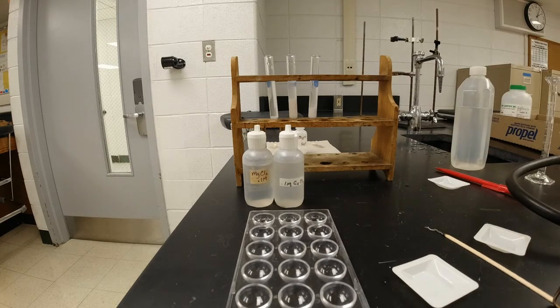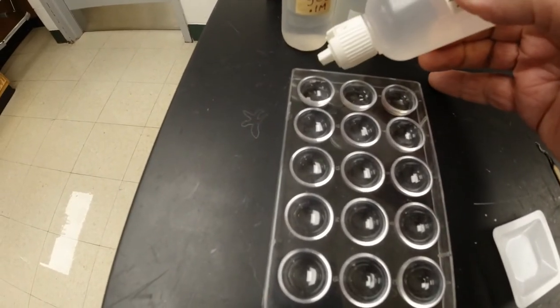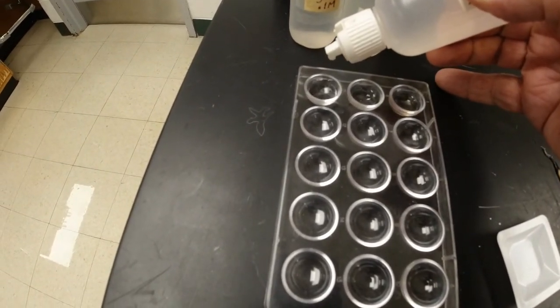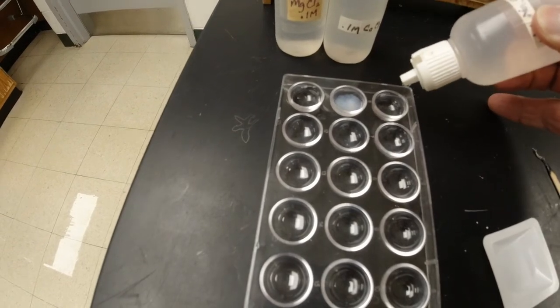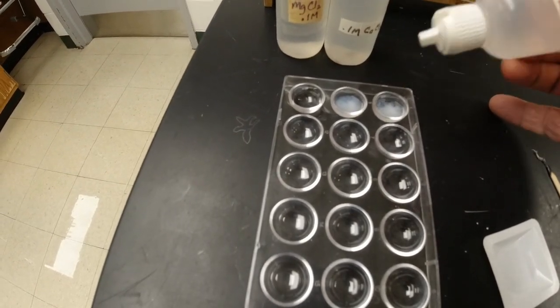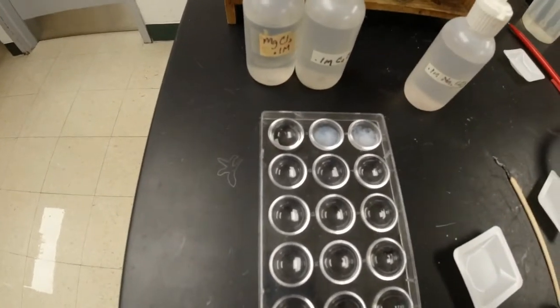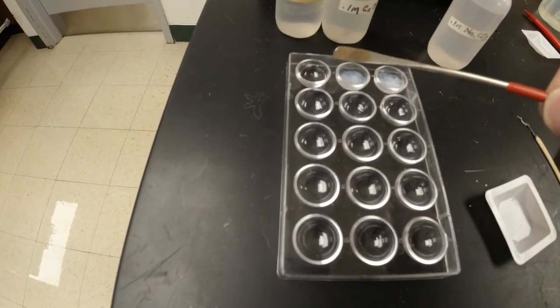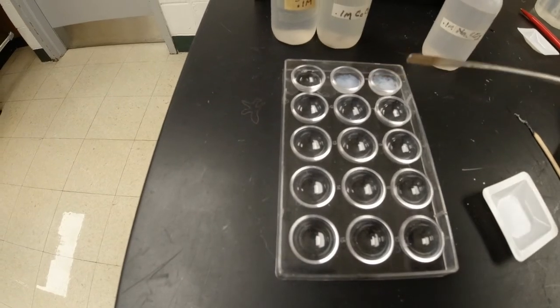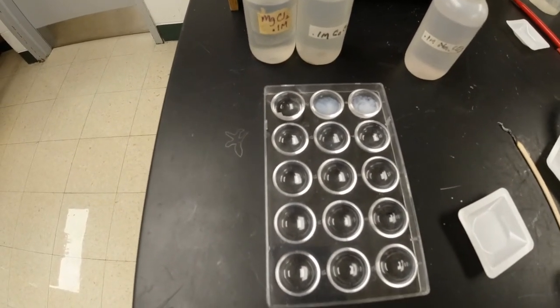So what happens when I put sodium carbonate on here? So I hope you guys can see this, but 1, 2, 3, 1, 2, 3, and 1, 2, 3. All right. So in each one of those, I got a white powder. Now, as I got it, this one is the lightest. It barely turned at all. This one is much darker, and that one has got the most white color to it of all.